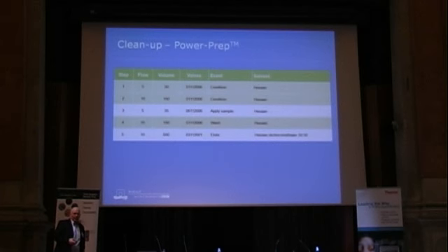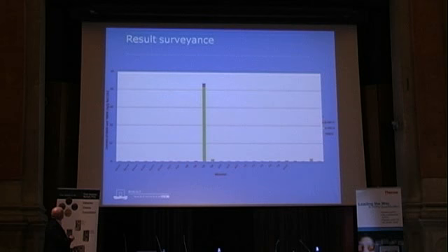Okay. We have good recovery. We have nice accuracy with the interlaboratory study samples we analyzed. It's a very fast method. We can do 9 samples in parallel. Of course, 7 real samples, 2 quality control samples, and it's not too laborious.